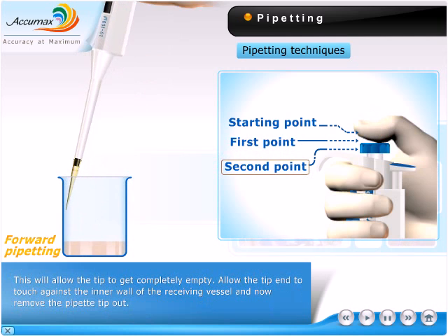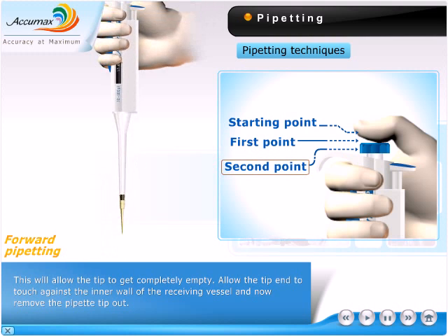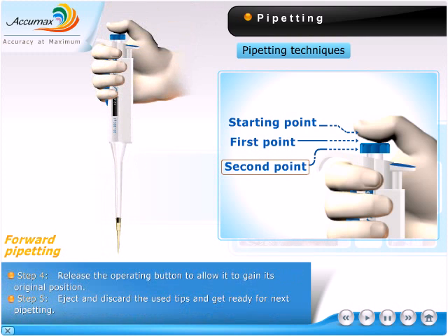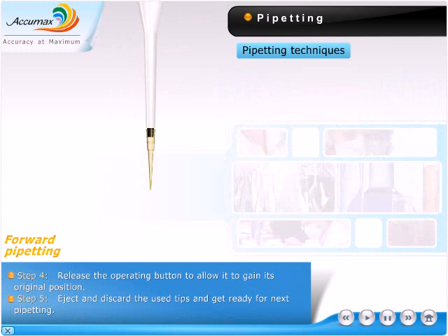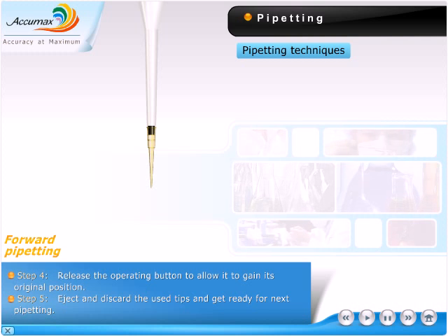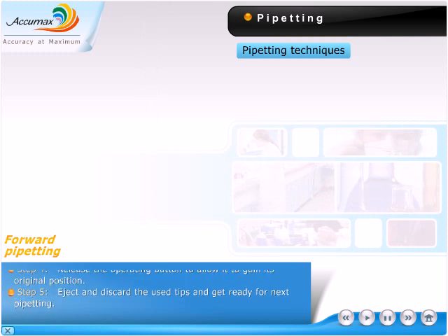Allow the tip end to touch against the inner wall of the receiving vessel, then remove the pipette tip. Release the operating button to allow it to return to its original position. Eject and discard the used tips and get ready for the next pipetting.